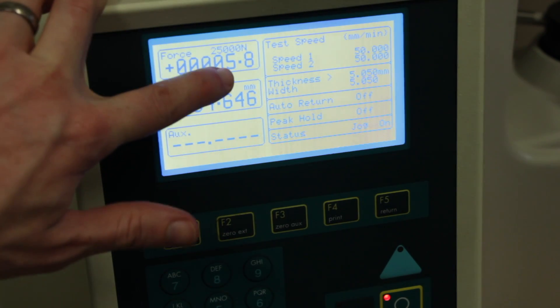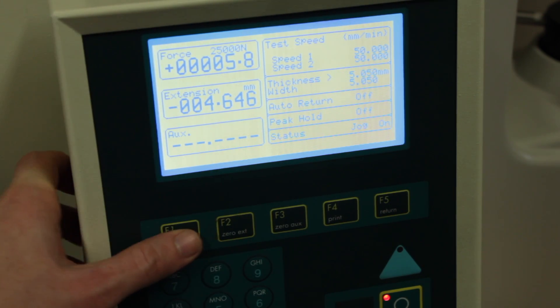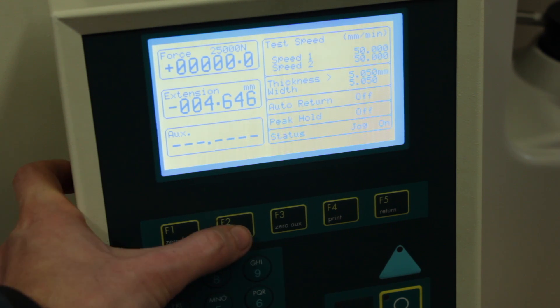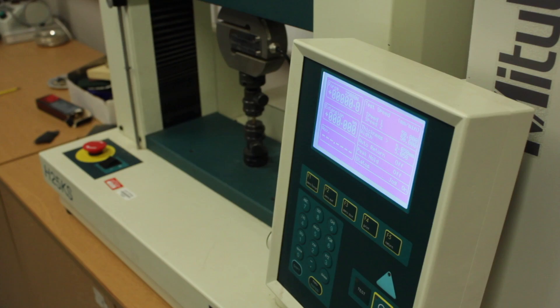Next, we need to reset the force and extension by pressing F1 and F2. Then we'll hit 6 to enter the full graphing mode.